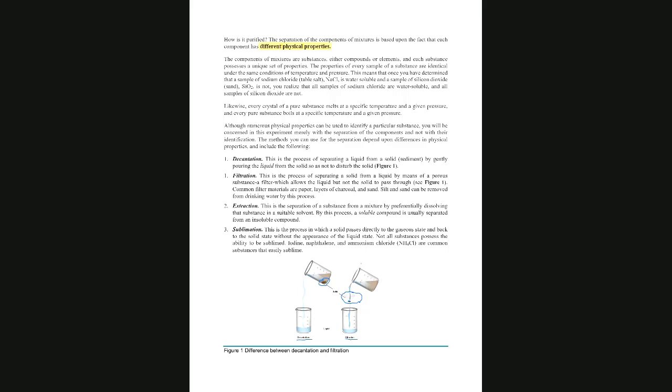Another technique that they are teaching us today is extraction. Extraction is when you separate a substance in a mixture by dissolving the substance in a proper solvent.